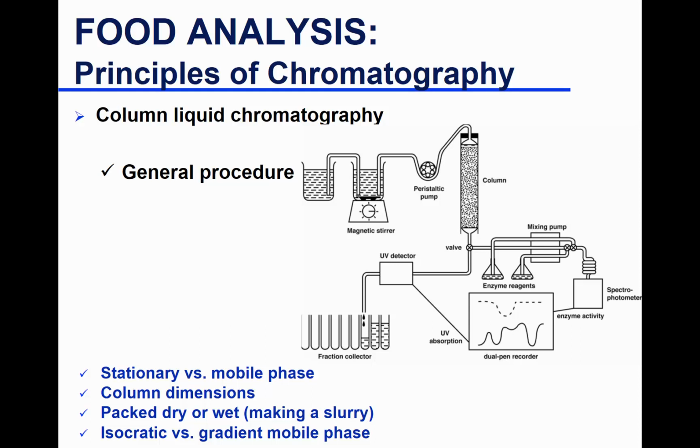It's still considered gradient, although the word gradient means that you are slightly increasing the concentration. But even if you're moving abruptly from like salt to water, you change the concentration of your mobile phase, basically. Yeah, I know the word gradient means that it's gradually changing, but sometimes you just abruptly change altogether.